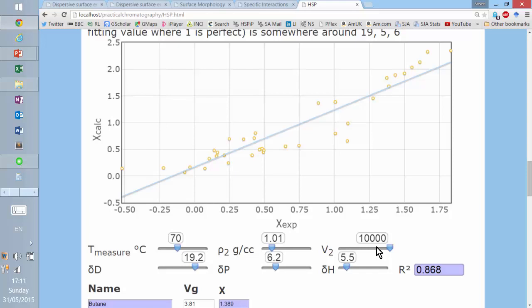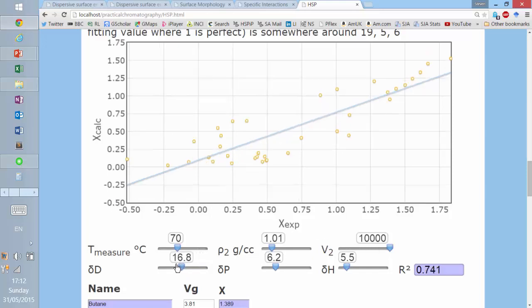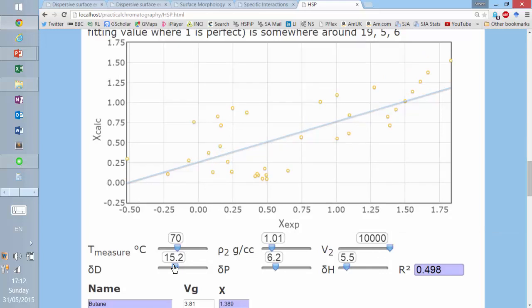Some very recent data from Dr. Brendley has shown that for some excipients, the attempt to fit it via this chi parameter is not just slightly wrong, it is catastrophically wrong, which means there is an error in our chain of logic. And hopefully in your discussions you'll be able to find that error, because once we can fix it, and we can go from VG values to something like chi, then we can start measuring HSP values.